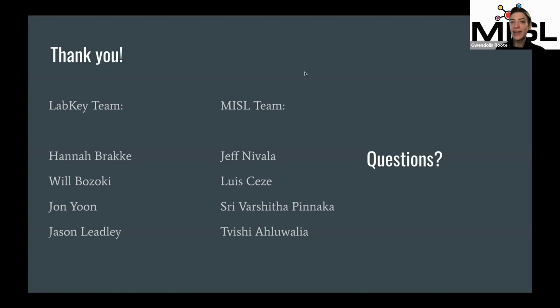And then for things that I knew that we would want to keep, but the researchers weren't available, I got some undergrads to do that kind of thing, which is a wonderful resource. I think that's great advice.